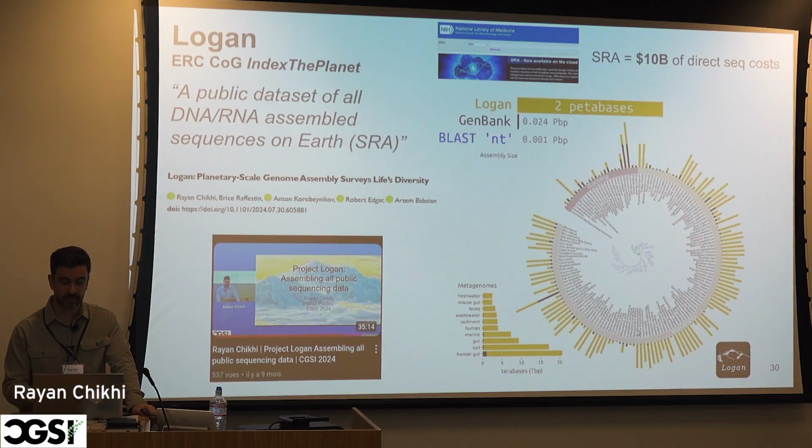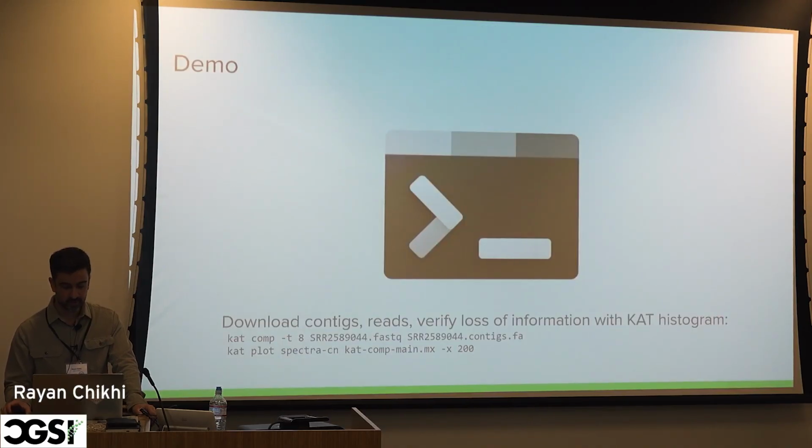I've plotted this tree for a subselection of organisms that shows the amount of data you have per species compared to the amount that's present on GenBank. And for some, or at least a good amount of organisms, there's almost no data on GenBank comparatively. So you can see it as an Earth-wide pangenome reference, species by species.